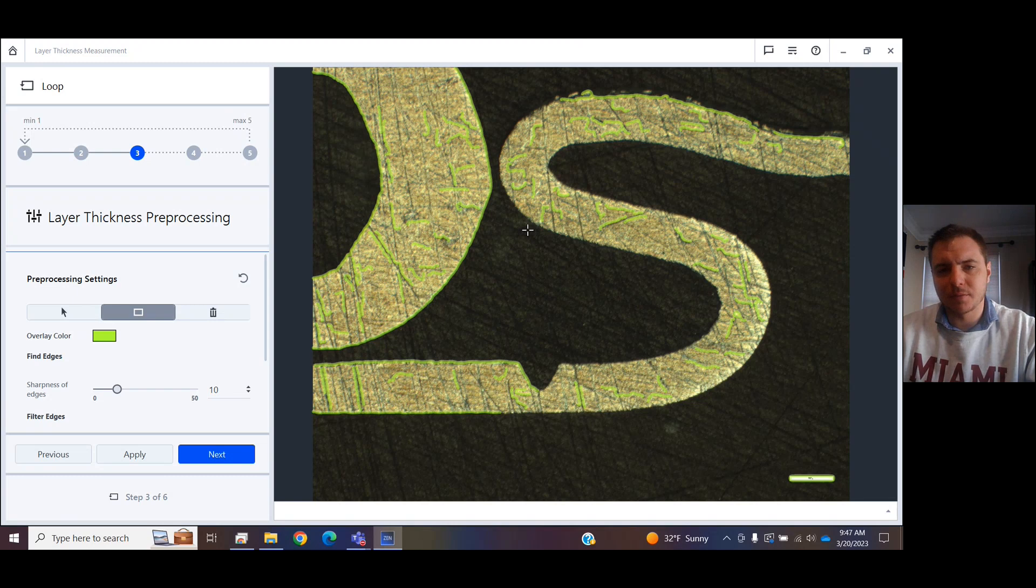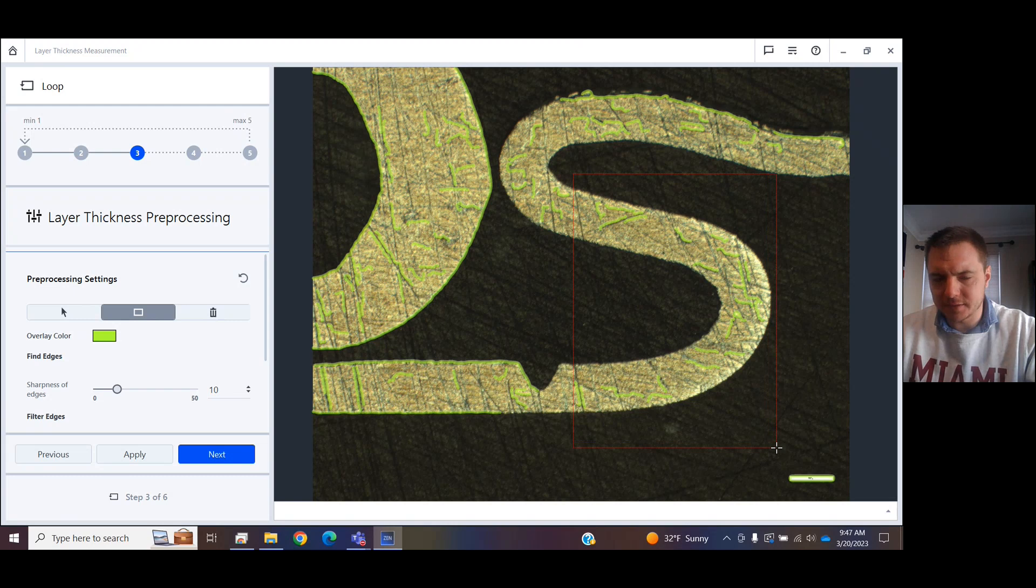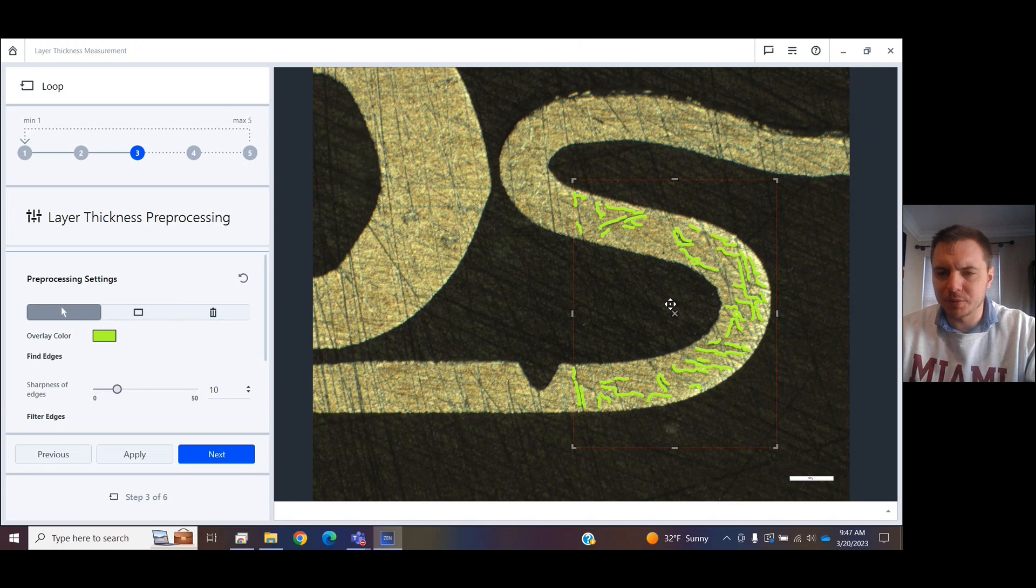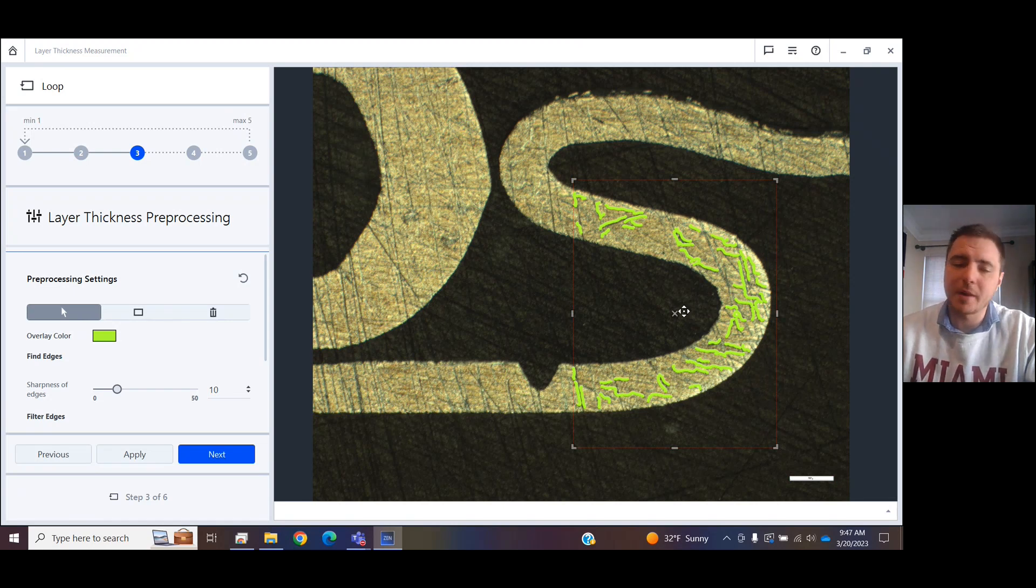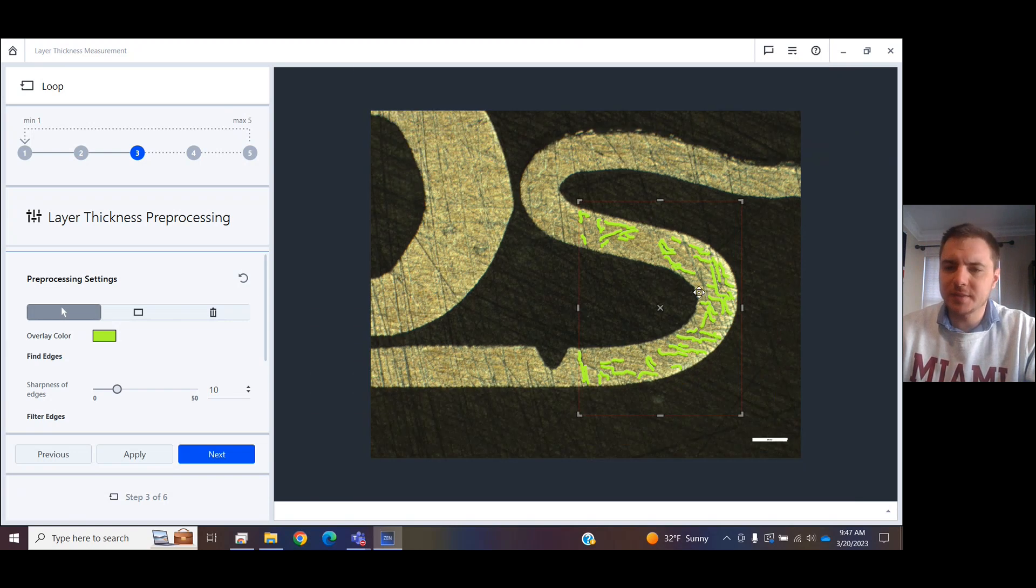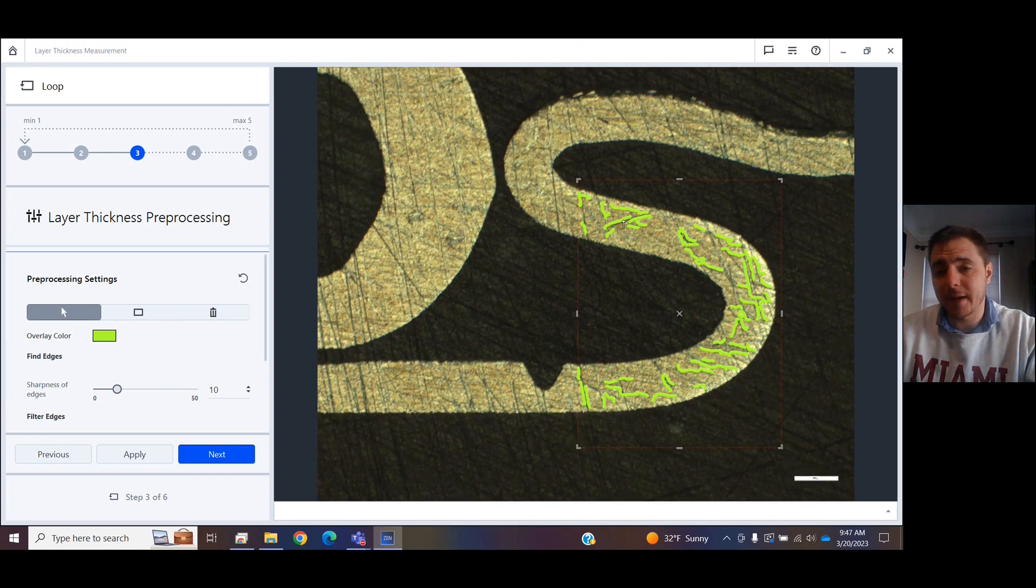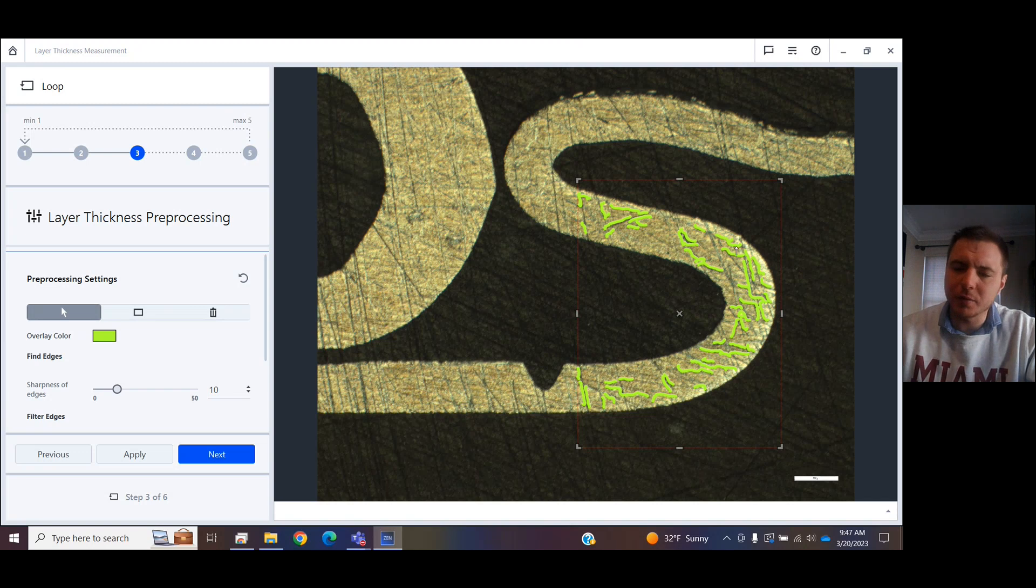You can click this box for frame, and now I can draw a frame over the area that I am interested in. Let's just say I wanted to measure the layer of this sample in this portion of the image taken on a Zeiss compound inverted. I see that I don't have the layers yet selected automatically. It's picked a bunch of the inclusions in the sample itself.